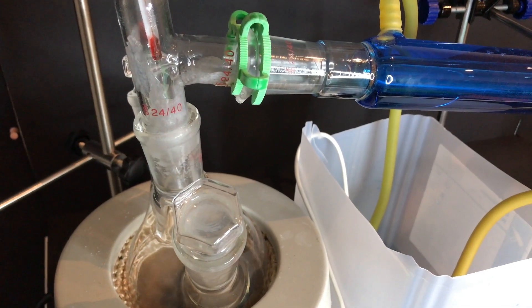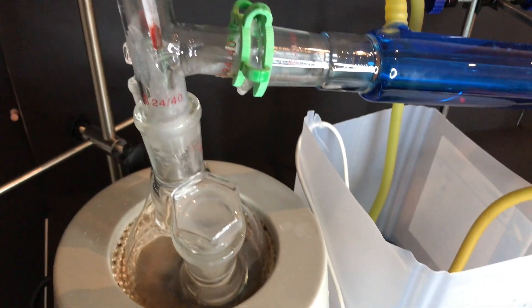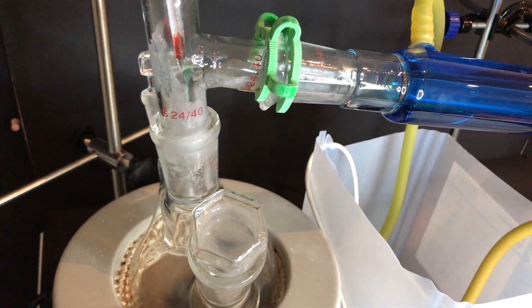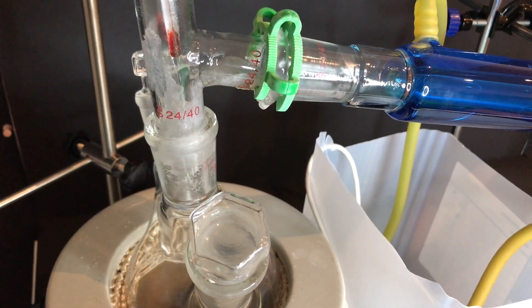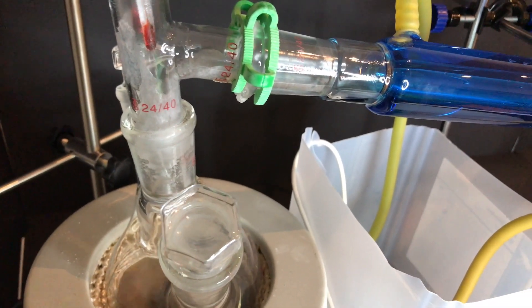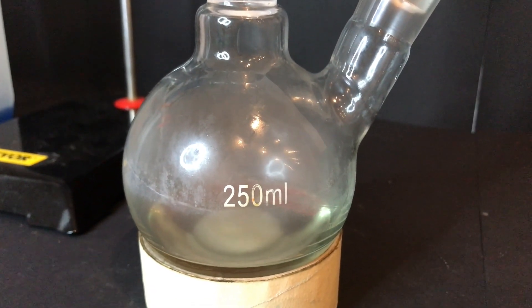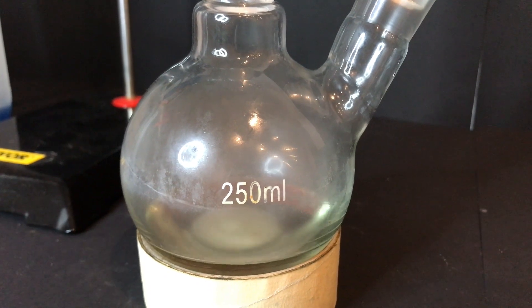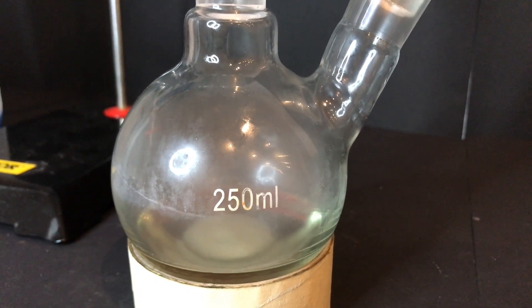At the end of the distillation the melted powder mixture has turned black. Here you can also see some adipic acid that has sublimed. At the end of the distillation you can see that some more cyclopentanone and water had come over. There is only some tar left in the boiling flask.